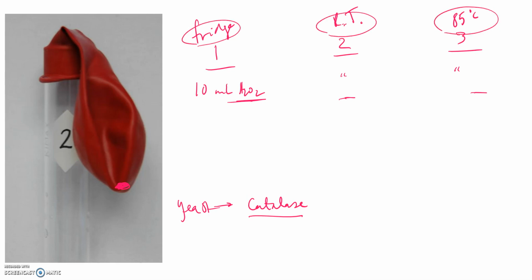And so you measured how much gas filled this balloon, right, the circumference of the balloon. And the amount of gas helped you to see how much reaction was actually occurring. And so probably what you saw is that you had an increase in your reaction rate as the temperature went up.